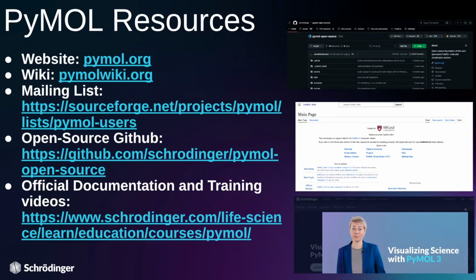We also have pymolwiki.org, which is graciously hosted by SBGrid, and we continuously thank them for their support throughout these many years. It provides a high quality, community-driven wiki for folks to contribute to and view documentation that is sometimes otherwise hard to find.